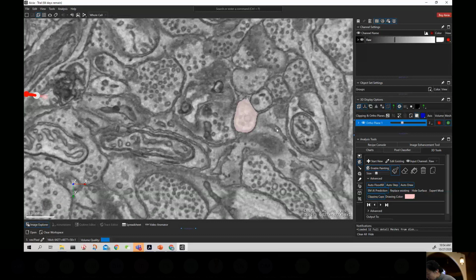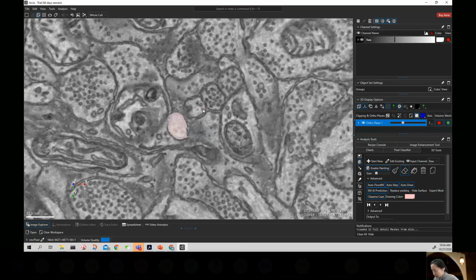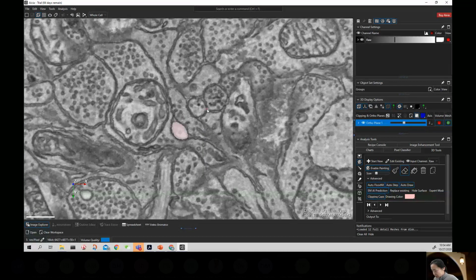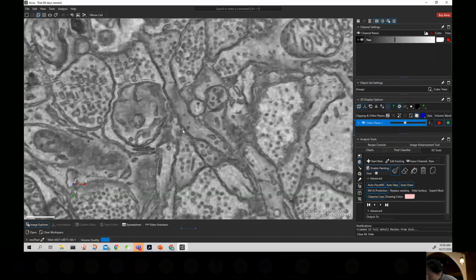Whenever we need to do some corrections, it's available and can clean the segmentation results very efficiently, and you can just step through. Usually at the end, you will get less confidence. While it's disappearing, it will start picking up other things.